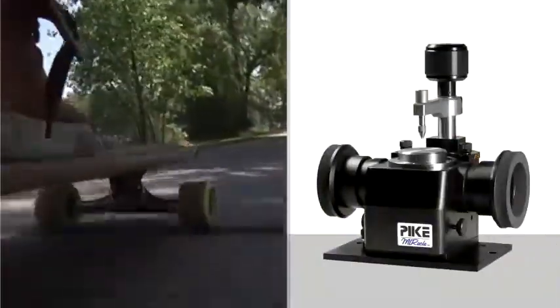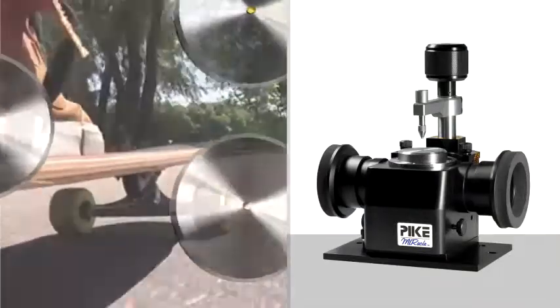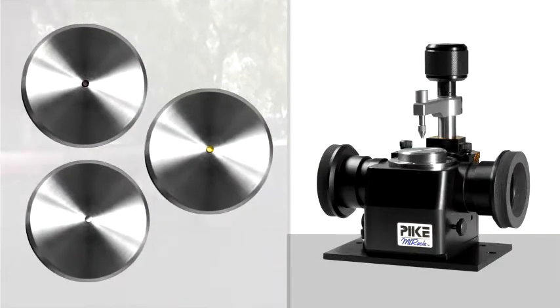The first step in using an ATR accessory is choosing the correct crystal. Diamond, zinc selenide, and germanium are the most popular crystals for a wide variety of applications.